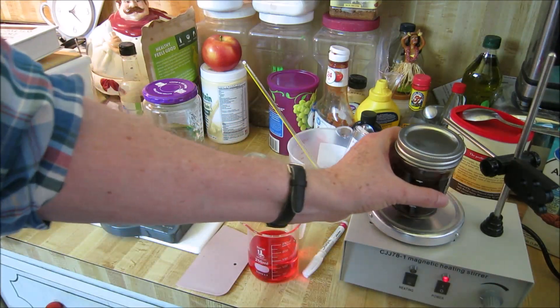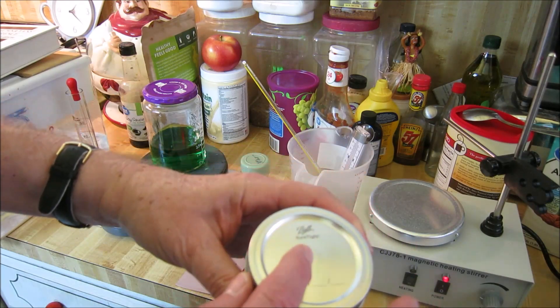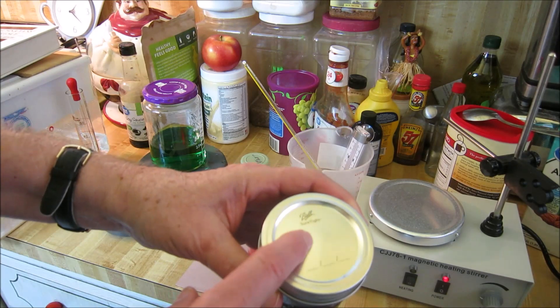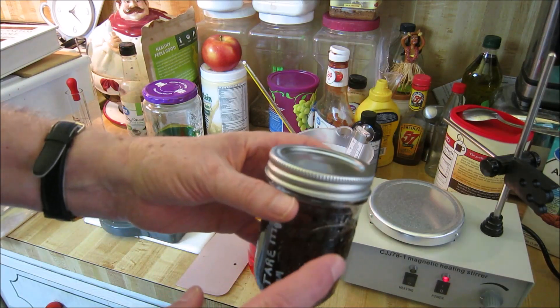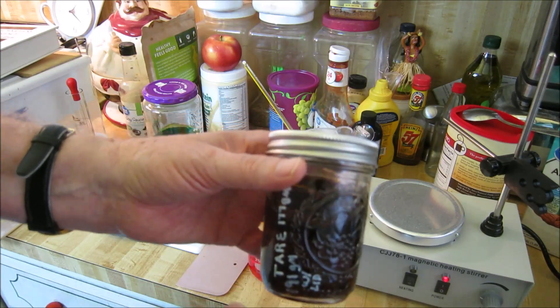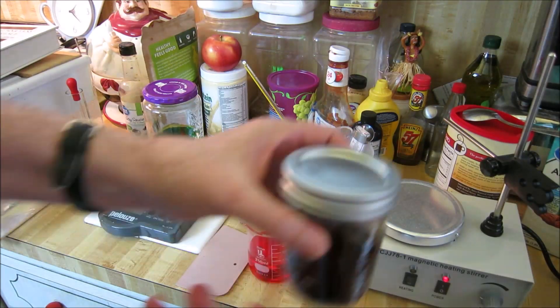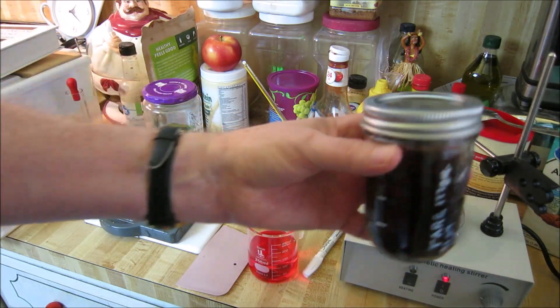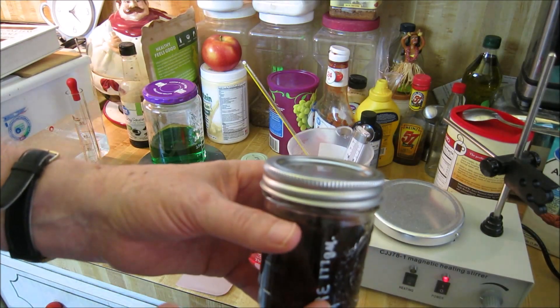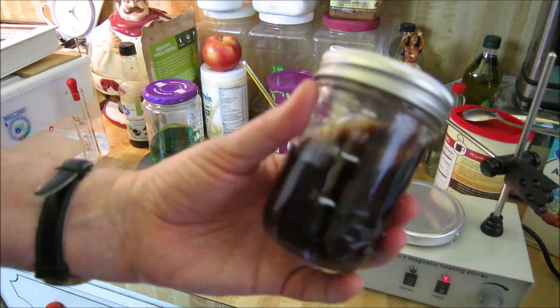Something also that's interesting about the ball jars is you can remove the lids and put a hole in them and then put a rubber stopper in the hole, and you can put a vacuum on the rubber stopper. That will put a vacuum in your container. So if you need to do different experiments inside a vacuum, you can make little vacuum jars out of your ball jars. And you can also attach tubing, glass tubing, and you can heat them, introduce different gases and so on. You can make them into basically a laboratory flask.